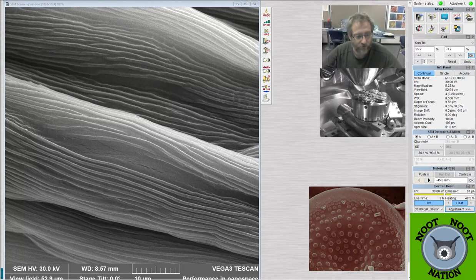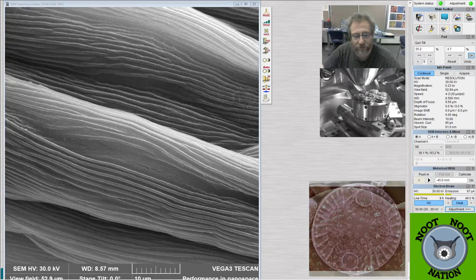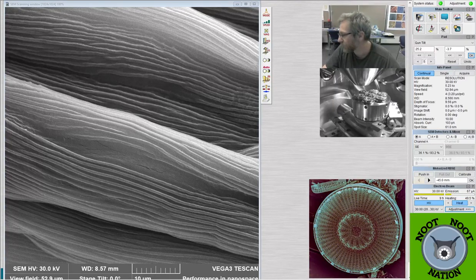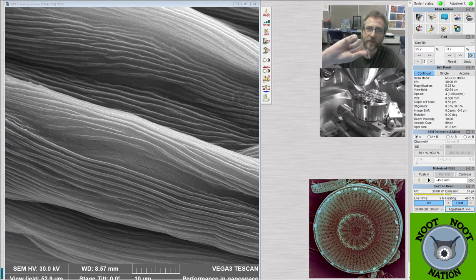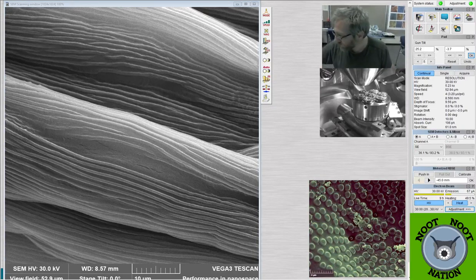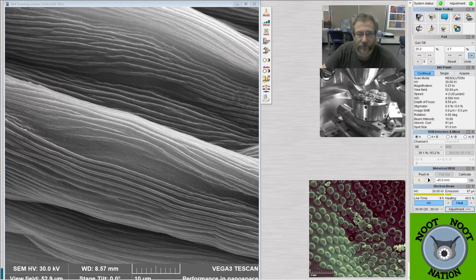But yeah, so today I went out this morning, and I collected a number of different types of pollen, mostly through collecting the plants, and then I spent the last hour or so prepping some of the materials for us here. The first thing that we're going to look at is, I think it's redbud, so it's this really bright pink tree flower.